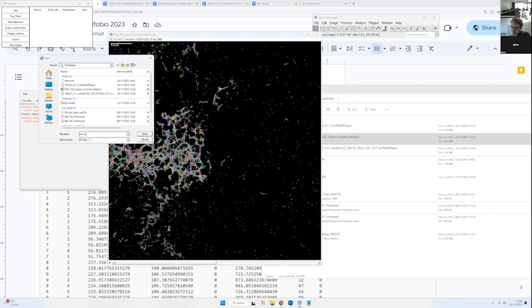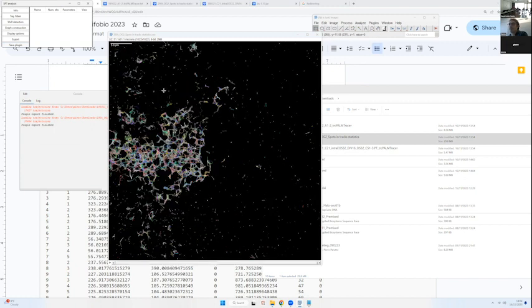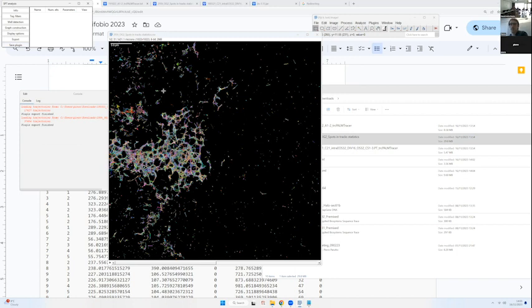Okay, yeah, so this we close. Click here, number 5, and then 299, yes, click.